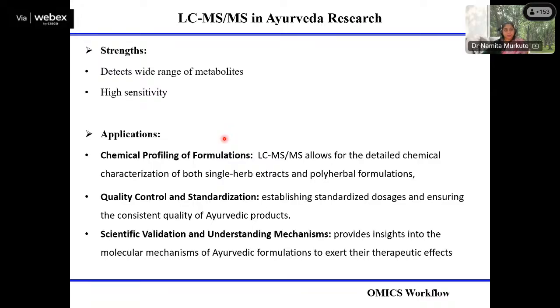Now LCMS. This method has the strength that it can detect a wide range of metabolites. It is not restricted to only volatiles. Mostly there is no need to do derivatization; you can directly add your sample. It has very high sensitivity. So Orbitrap and LCMS/MS, all of these come under the LCMS technique.